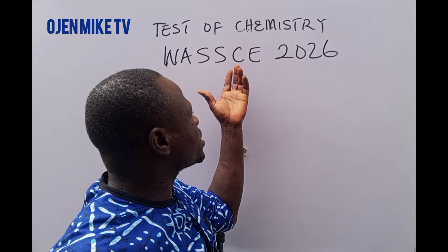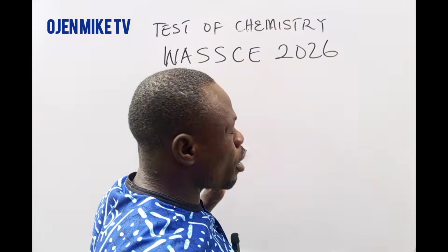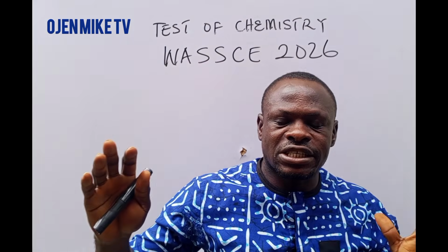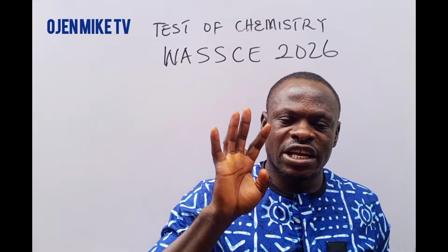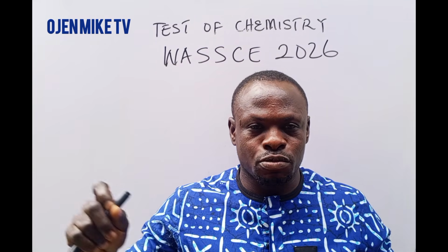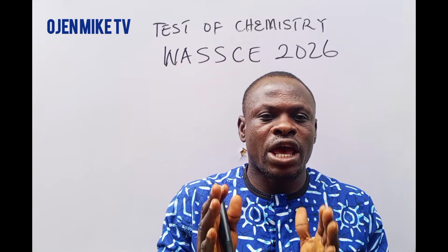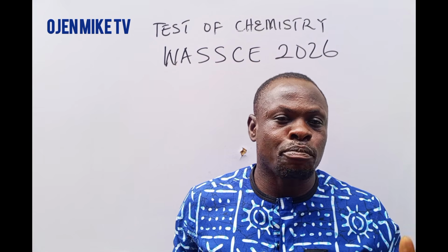Chemistry Practical West African Senior School Examination 2026. Now, remember, the practical chemistry in West African exams is divided into three parts. Number one is titration, acid-base titration, all right? And we have extensively discussed that acid-base titration in our previous video.